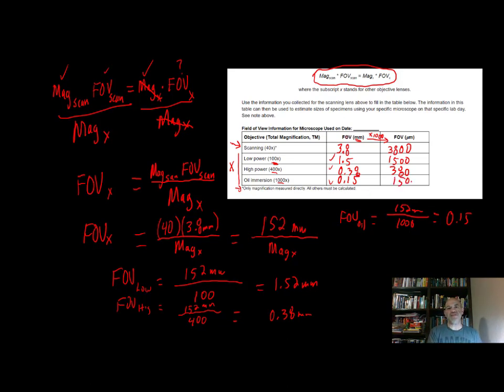So now that I have this table, you built this table. You do it when you first start using your microscope. Now you have it and you can reference it for whatever size plate you're using, right? Like going back to that Apple analogy on the plates. If I'm using a high magnification, the plate is smaller. That means I need to use a smaller field of view diameter.